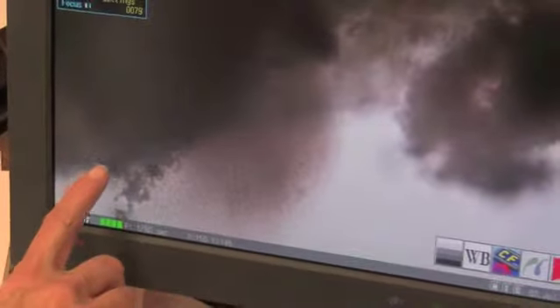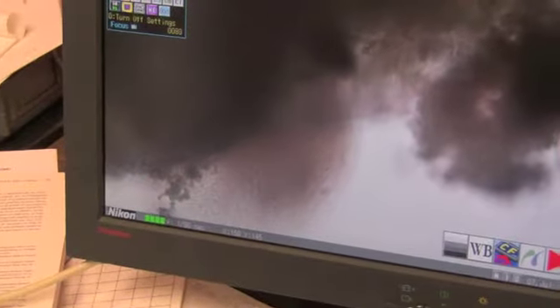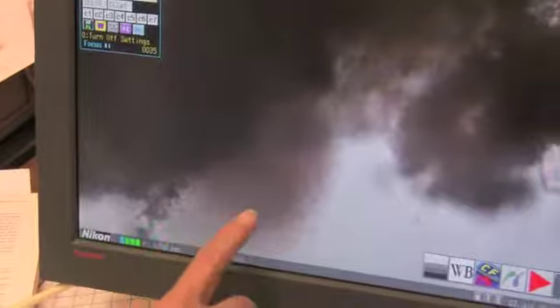So Bob, once again we're looking at a different tomato sample, and what we're seeing here on my microscope, and I'm going to have to adjust it just a little bit, is once again a cloud of bacteria oozing out of a cut piece of leaf.